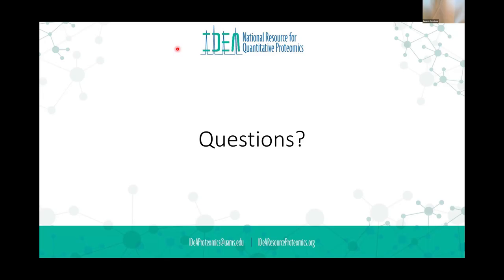Yeah, so it could work. We'd have to talk about what level of Triton, but we can handle any detergent. We just have to know what it is. I'll give you precisely the components in my lysis buffer. So the question is, can we handle samples where you've used Triton X to isolate a cytosolic component? Yes, we can. We do a chloroform-methanol extraction to remove the non-ionic detergent.